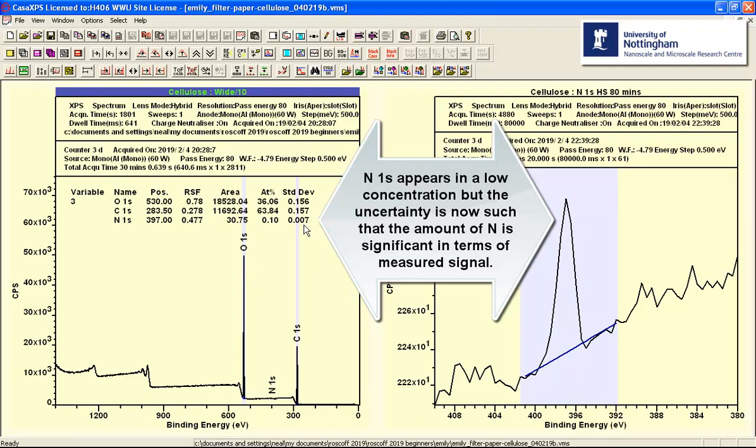The uncertainty now, because of the extended acquisition time, has meant that the uncertainty in the standard deviation is now 0.007. So this is significantly smaller than the value that we can include in an atomic concentration calculation. So at this point, we can see that while small, the nitrogen peak is now well within the detection limit for these data. And this has occurred simply because the nitrogen region has been singled out and measured for considerably more time than was devoted when the survey measurement was taken.